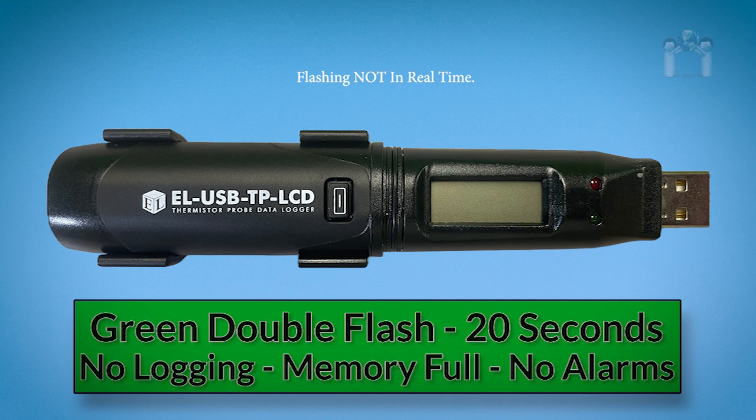If there is a green double flash every 20 seconds, the memory is full and the data logger has stopped logging but no alarms have been triggered.